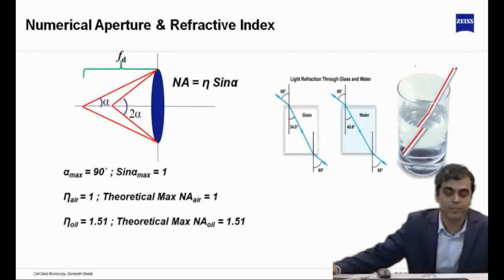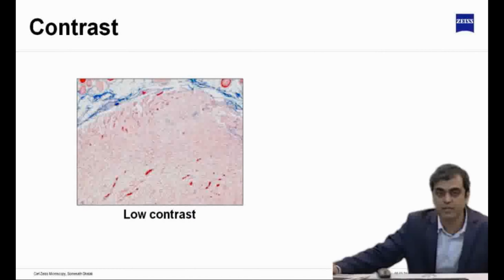So this has to be kept in mind, and then by using the appropriate immersion oil, or even you have to check the objectives. If it is a water dipping objective, then water has to be used to fill the gap between the objective and the glass. Then the last and the most important is obviously contrast.